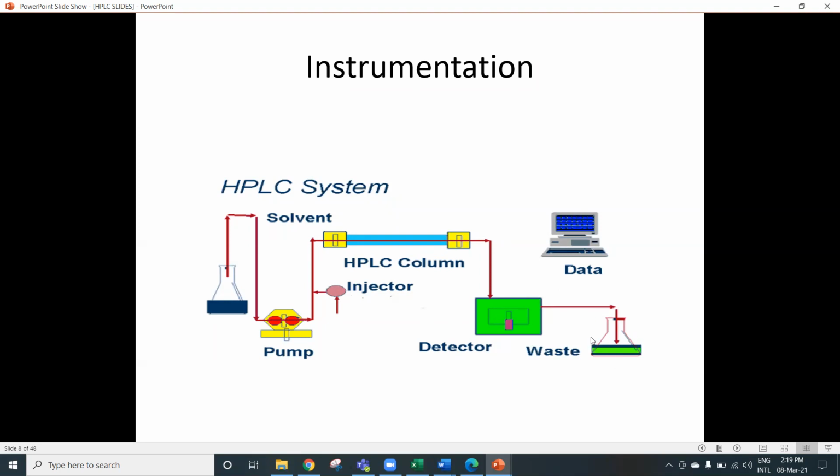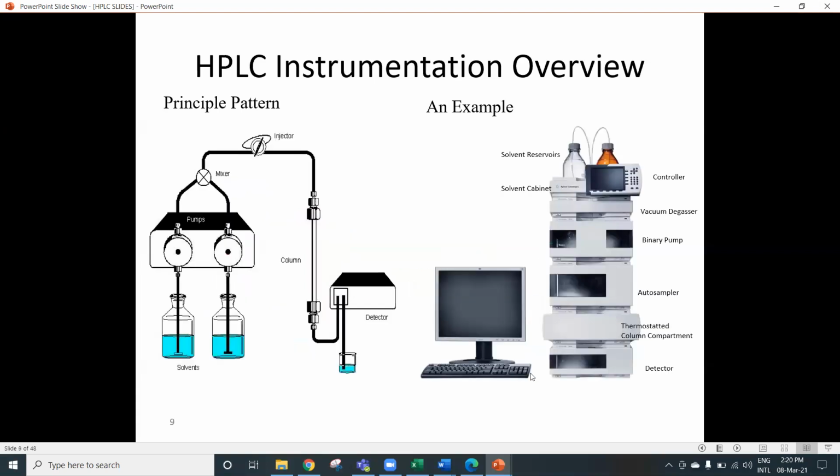And like I said, with this sample, you can collect different fractions. Let's say at 2 minutes, there's a particular fraction that gets to the detector. You can put a vial there and collect that fraction. Then maybe your chromatogram shows another analyte reaching the detector at another time. You can place different vials and collect your different fractions at the different times that they come off the detector.